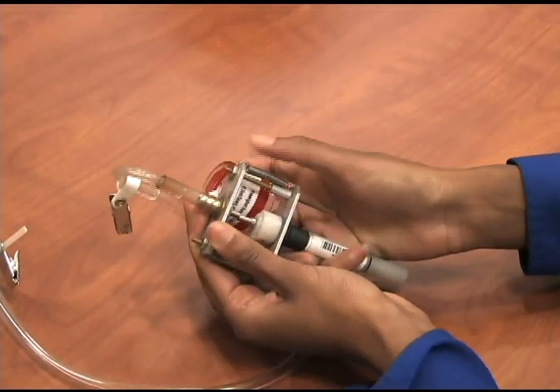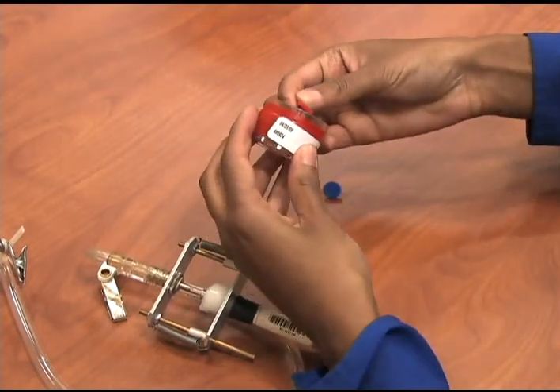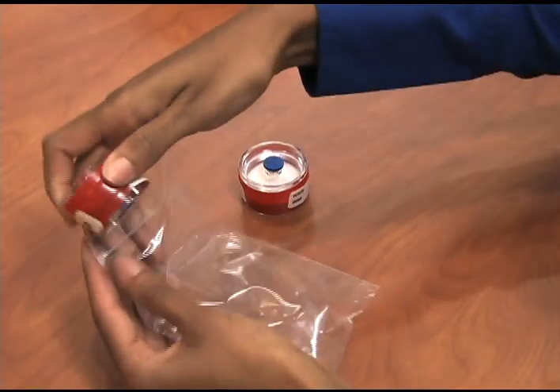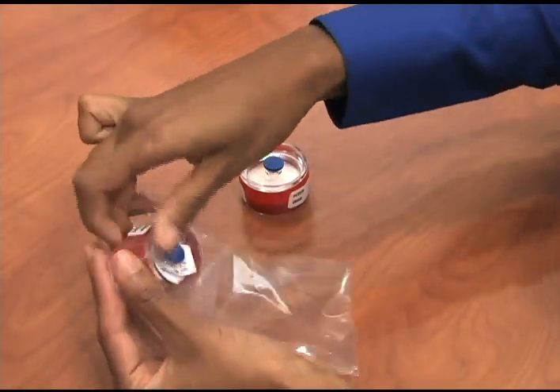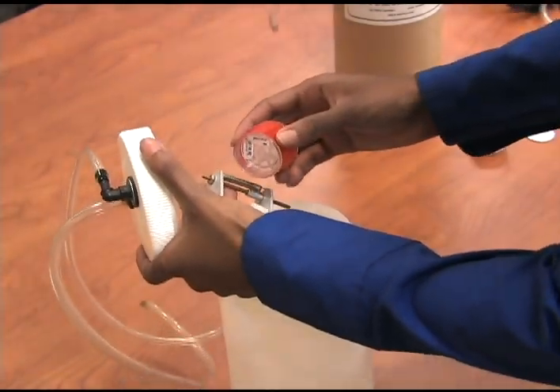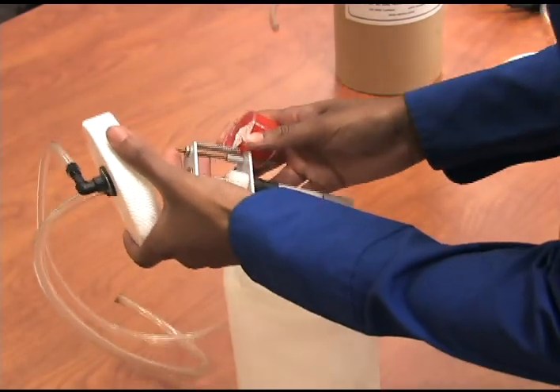After sampling, remove the cassette and reinstall the nibs, and wipe off any dust accumulated on the cyclone prior to shipment back to the laboratory. Place the cassettes in the zip-lock bag for shipment to Galson Laboratories. After completing the sample, a post-calibration must be performed on the pump.